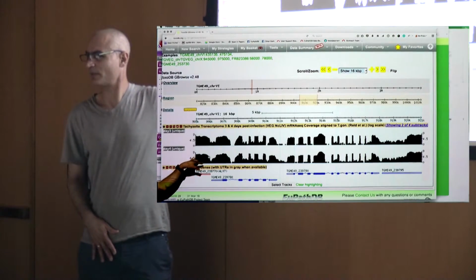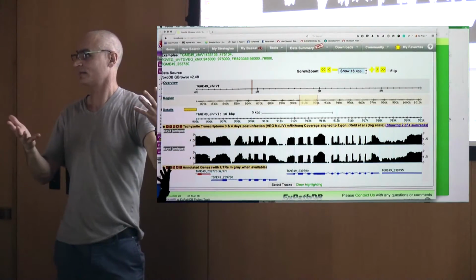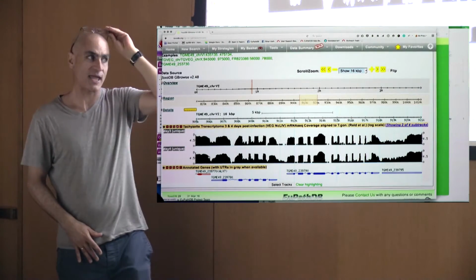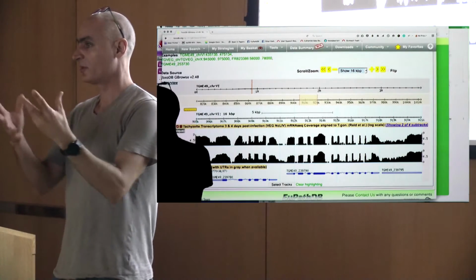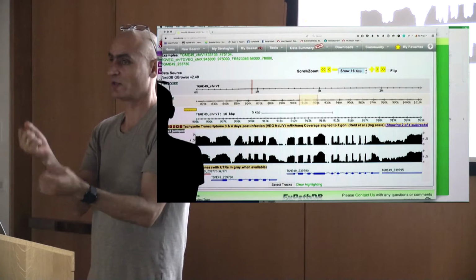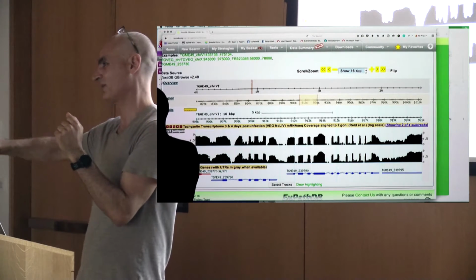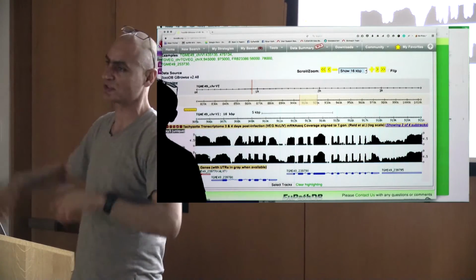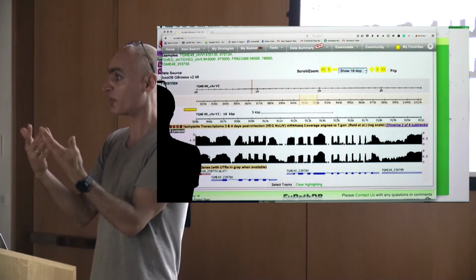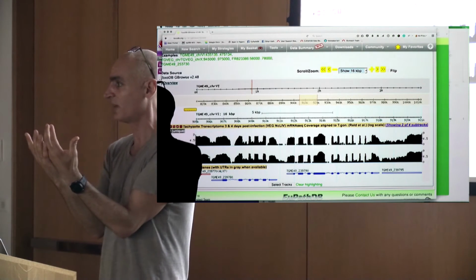Did you look at similar graphs like this today? It's basically a y-axis and an x-axis, and this simply tells you how much RNA was found from this region, from these samples, from this experiment. The higher it is, the more RNA that was found. Just as a reminder, when you do an RNA sequence experiment, you take the sample out of your test tube, you extract the RNA, you break it up into small pieces, and then you sequence those small pieces of RNA. The method of sequencing is really irrelevant. There's high throughput sequencing, low throughput, next generation, second generation, third generation, whatever you want. But they're all methods that allow you to determine the nucleotides, one after the other, in the pieces you're sampling. Once you have that nucleotide information, it's a jumble of little pieces of sequence in a file.